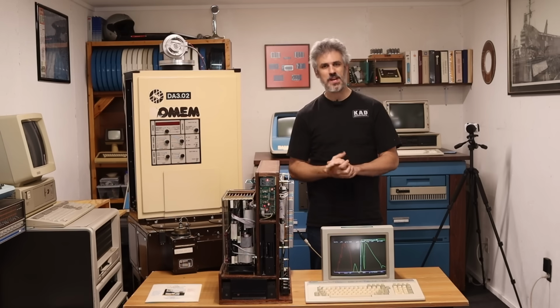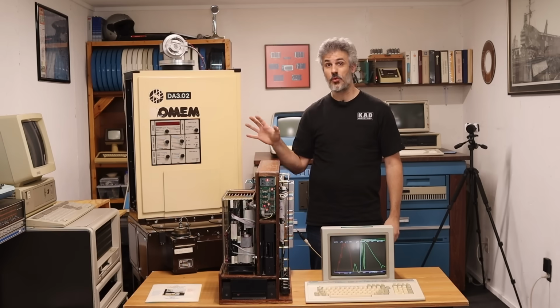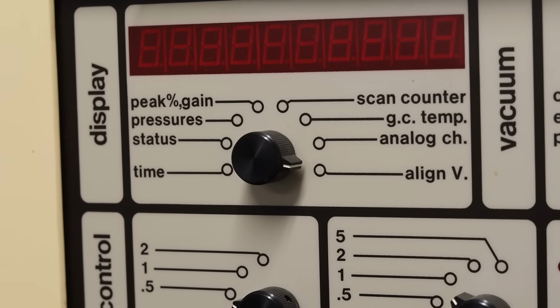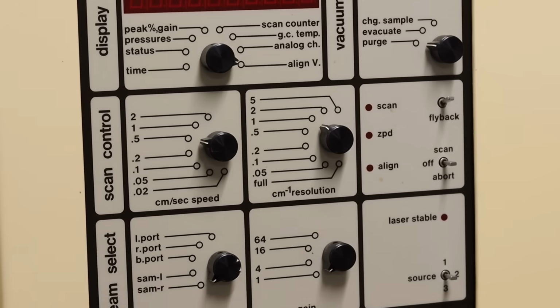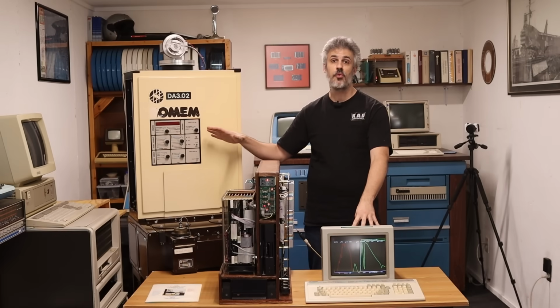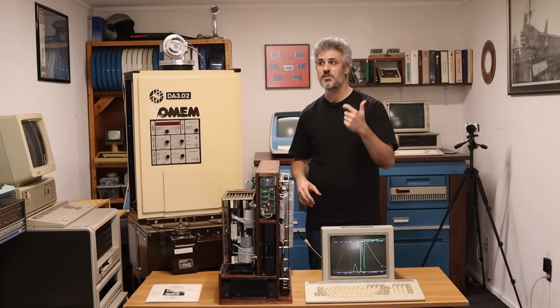So what is the actual game plan here? The Bomem DA3 can actually be controlled quite extensively with the front panel. So initially we're going to bring up just the DA3 itself without the PDP-11 connected to it. Make sure that everything is kind of doing what we expect it to do. Then we're going to get this PDP-1173 hooked up to it and controlling it, and try to get some spectra in the visible range and not under vacuum.